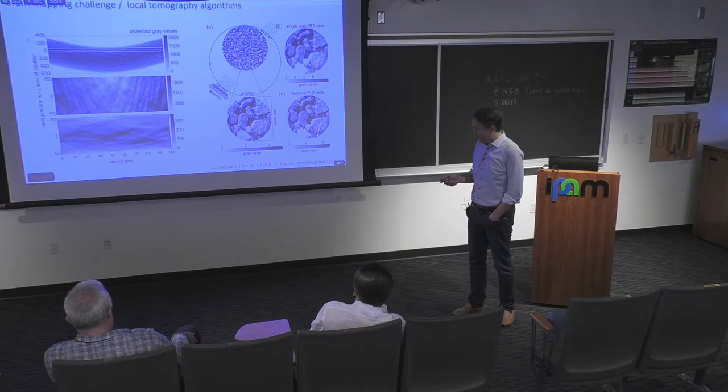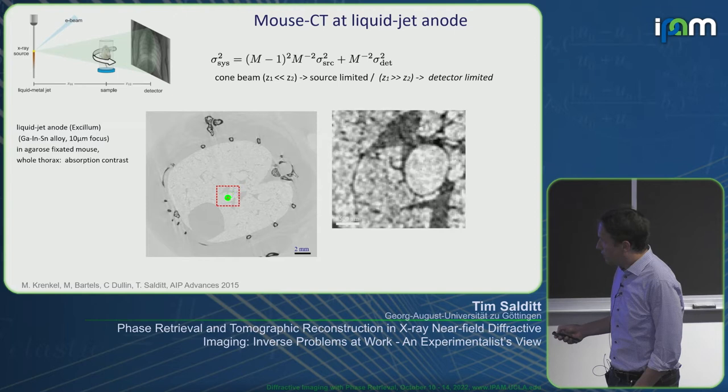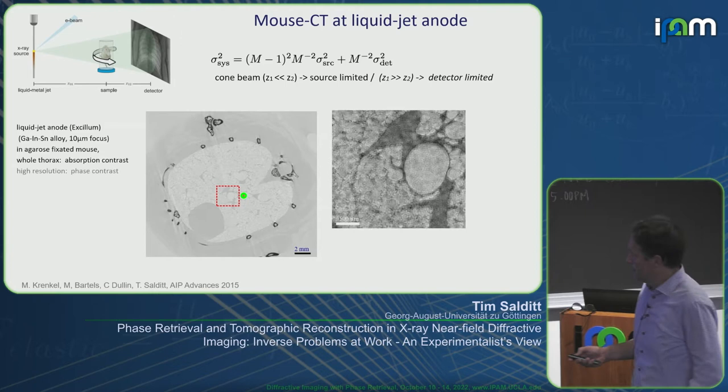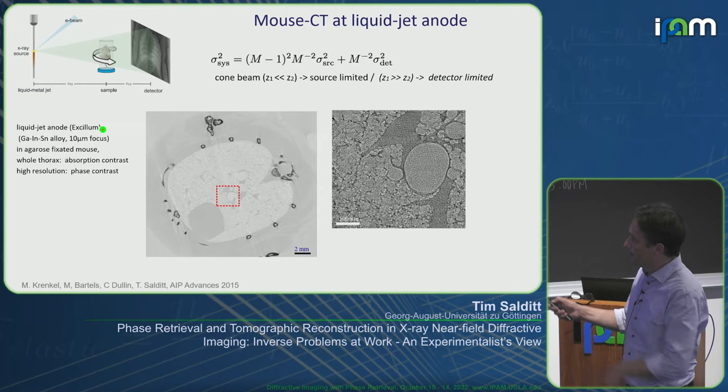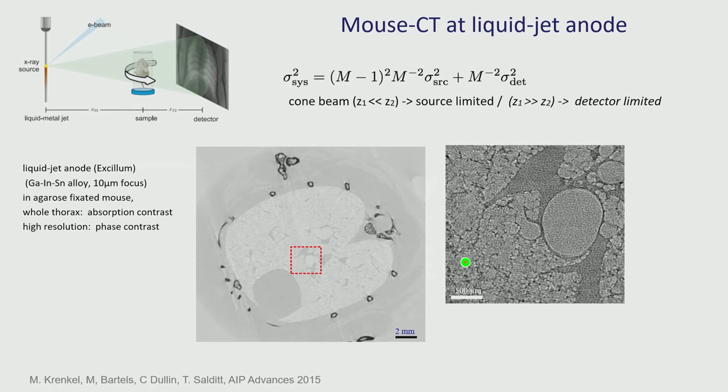and many good mathematical works. But let's go back to the phase retrieval problem, and let's make a higher resolution experiment and do ROI tomography on just one part of the lung, and expect some better visibility for the soft tissues. We could take a higher resolution detector, for instance, at this liquid metal jet X-ray source, and we reconstruct that data. It looks promising, more features. We want to see the small alveoli, the functional tissue, the parenchyma of the lung. But without treating this phase effect and the partial coherence, it probably looks very noisy and inconsistent.